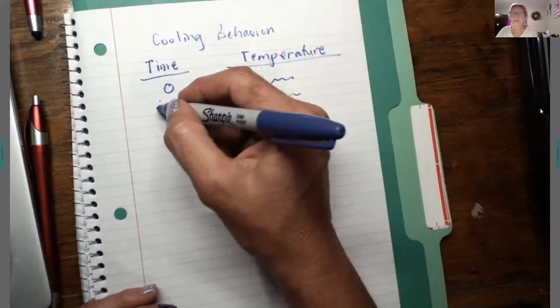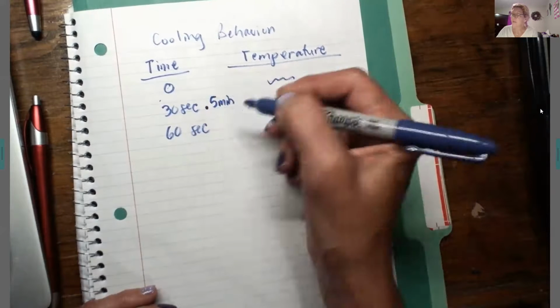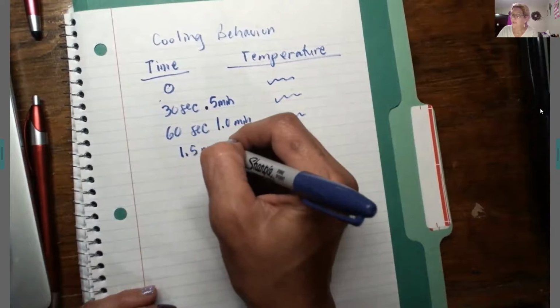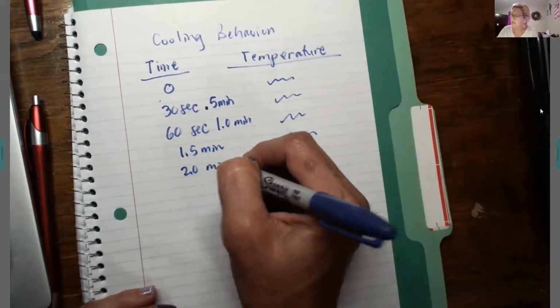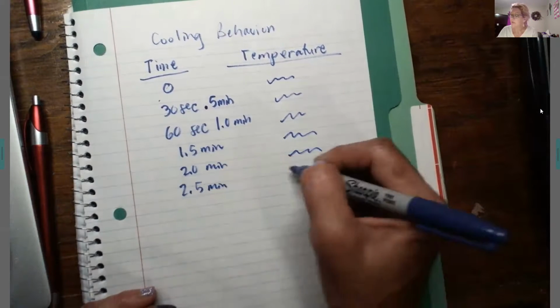So we're going to go ahead and put this in minutes. I'll just save you a little time. 1 minute, 1.5 minutes, and you'll do the temperature. Then at 2 minutes, you'll do the temperature. And then at 2.5 minutes, you'll do the temperature.